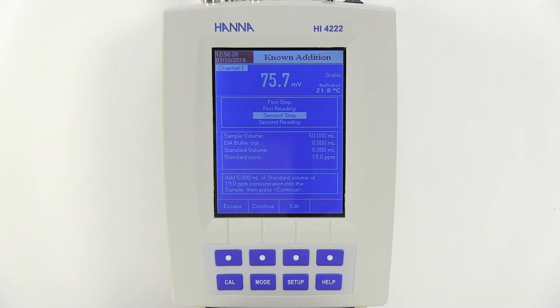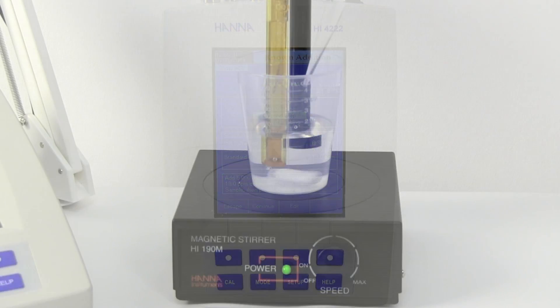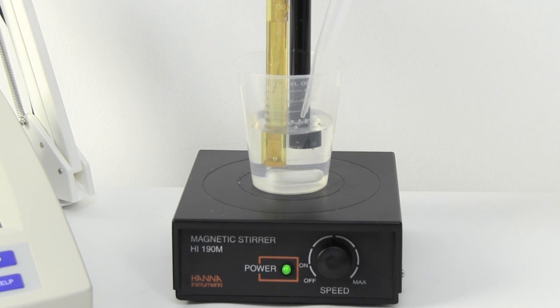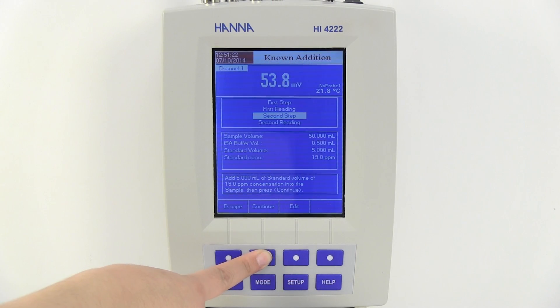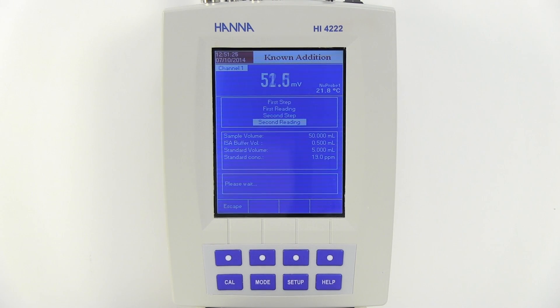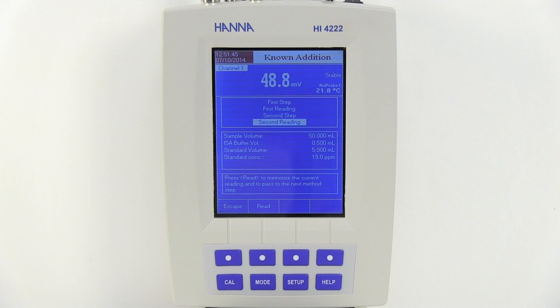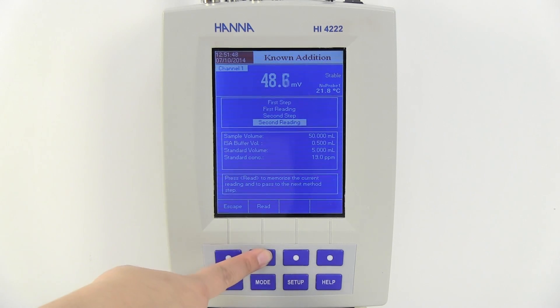We are now in the second step stage. The meter will prompt you to add 5 mils of the 19 ppm standard. After addition, press Continue. We are now in the second reading stage. Again, the meter will wait for a stable reading. Once this reading has stabilized, the meter will prompt you to press Read.